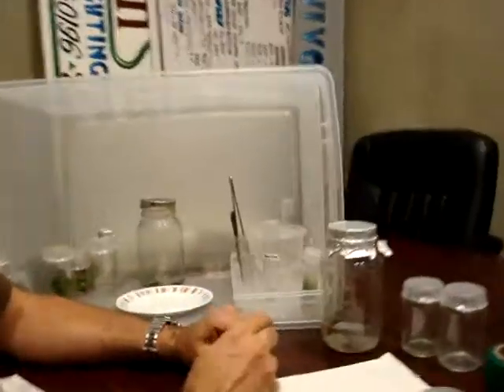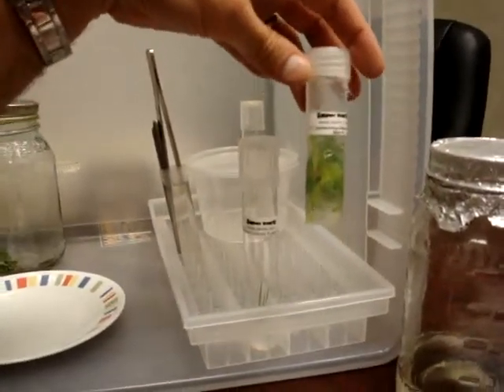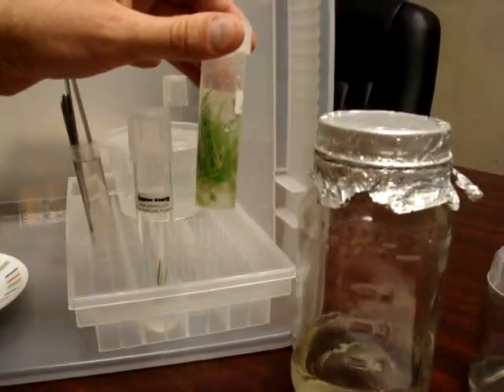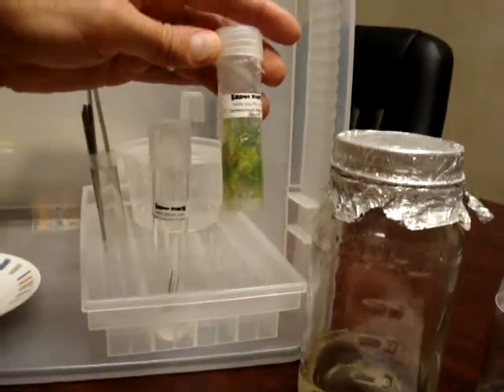It doesn't matter what plants you put in a tube versus a jar. In that jar you have over there, it looks like the plants are completely growing up against the plastic. Is that going to cause any problems? It is not. You're not going to get any disease because you're already in a sterile environment. That's right — if no disease started growing right from the beginning, it's never going to happen.